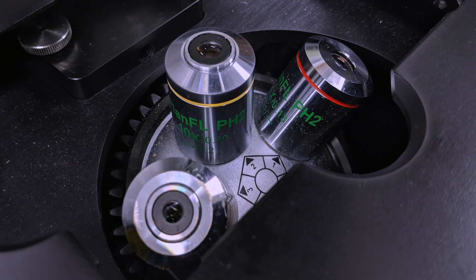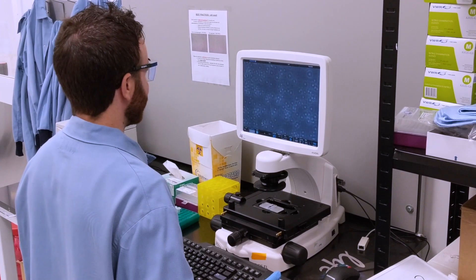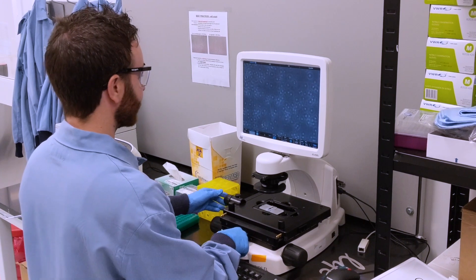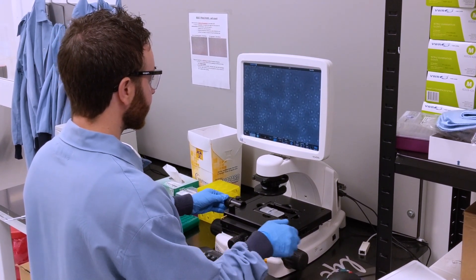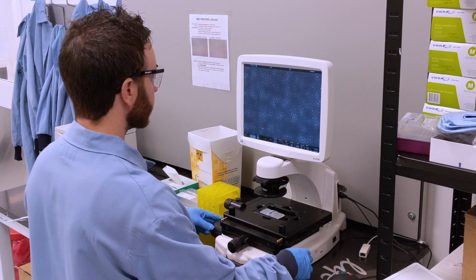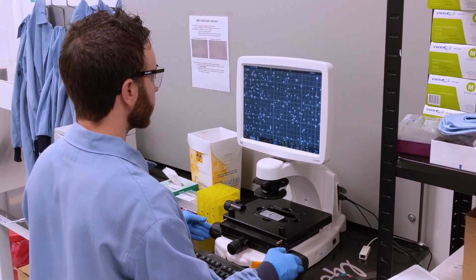Using the 10 times objective, look into the microscope to view the chamber of the hemocytometer containing the cellular suspension. Adjust the coarse focus knobs until you see grid lines come into focus.